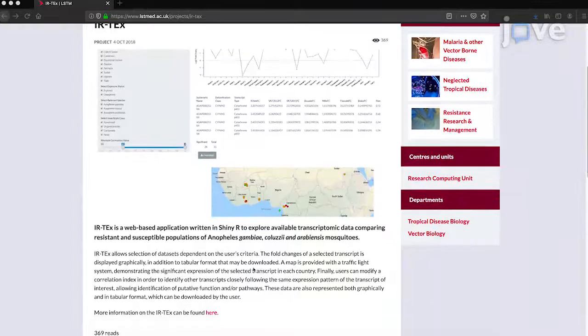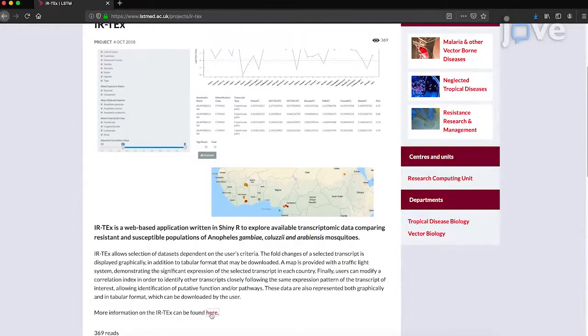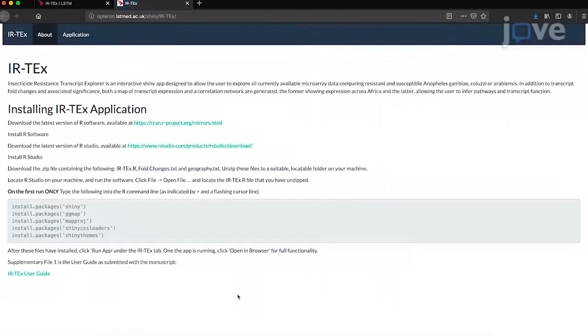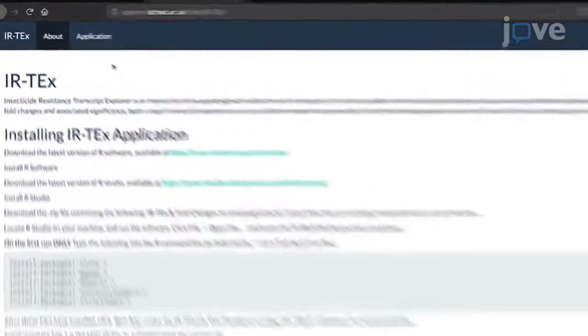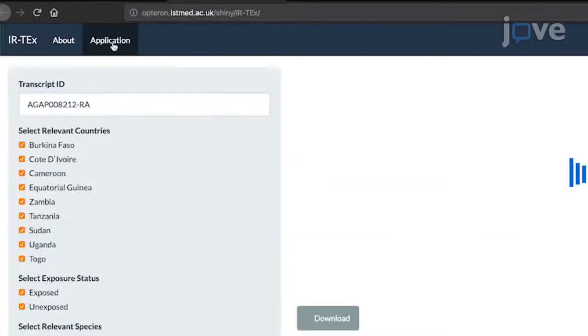To begin, follow the link at the bottom of the LSTM IRTEX project page to run the IRTEX web application in a web browser. Once the web page has initialized, click the application button at the top of the page which will display the application and associated outputs.